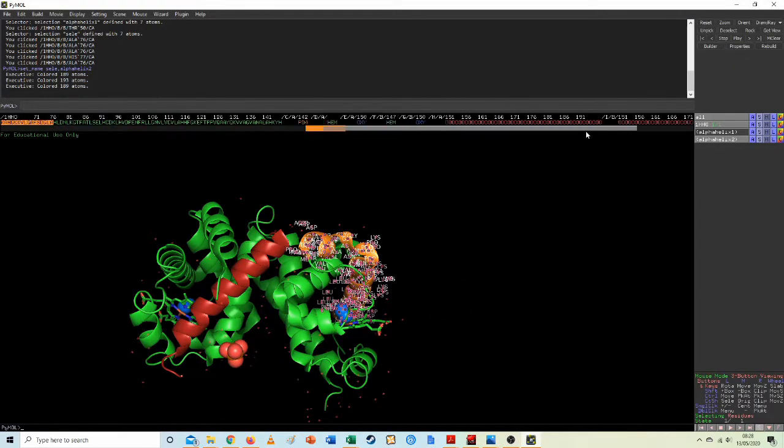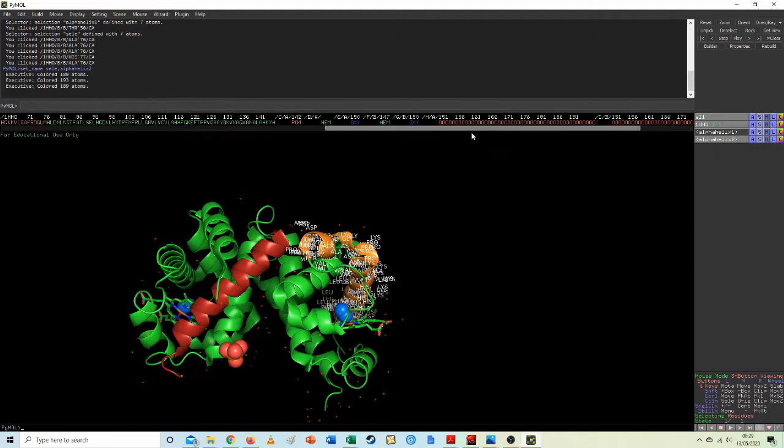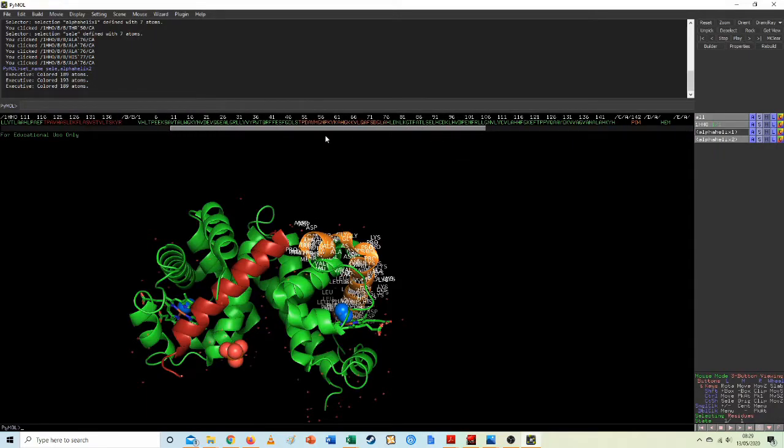We'll go back. What I want to do is actually deselect this entire thing. There we go. I deselected that, and I'd like to hide the labels if I can. Oh dear. Okay, I'm going to go back here.